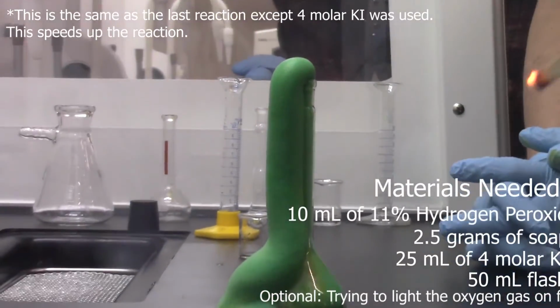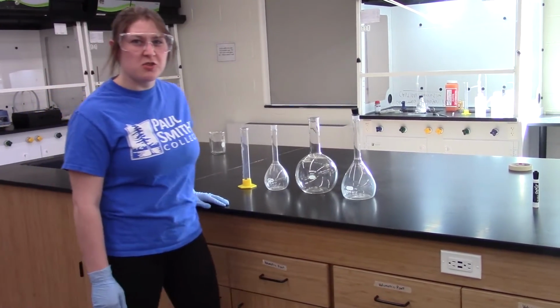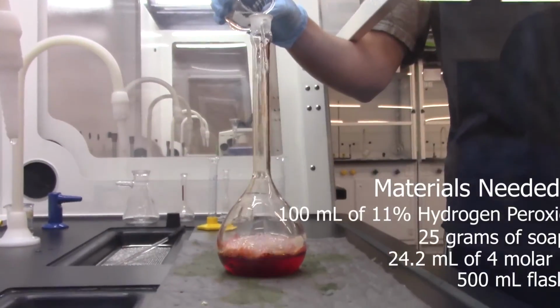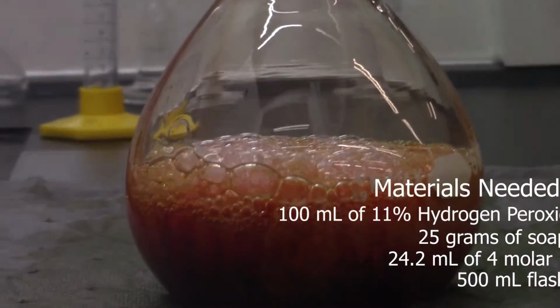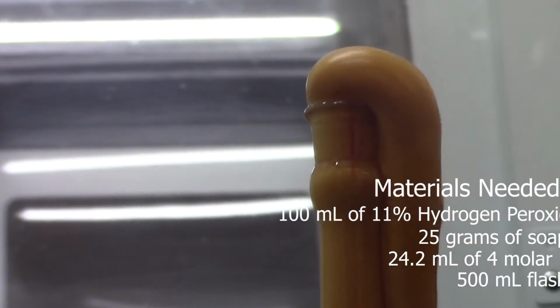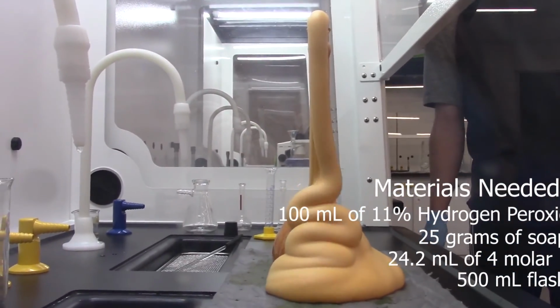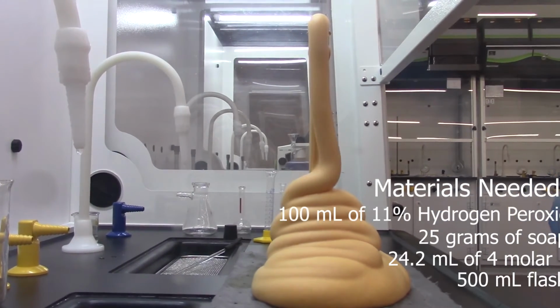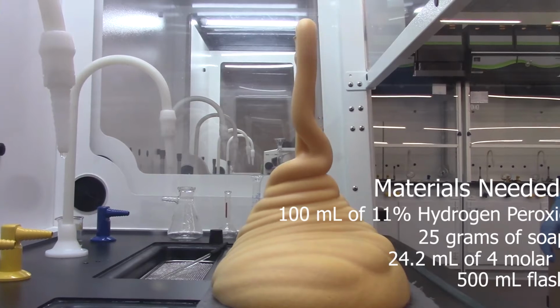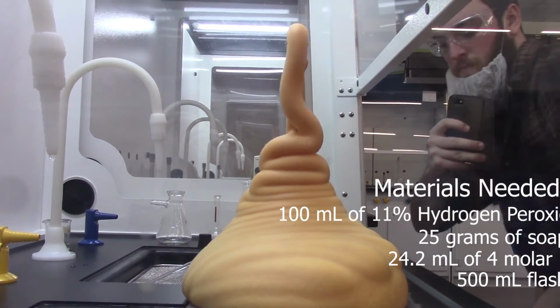Alright, Keegan, you're up. Please light. With all of the flasks they used so far, it looks like they're going to go to the extreme. Oh, it started. It's orange. That is a lot, just pouring out of there. And it's going fast. You can see why they call it toothpaste though, the way it's sort of falling on itself.